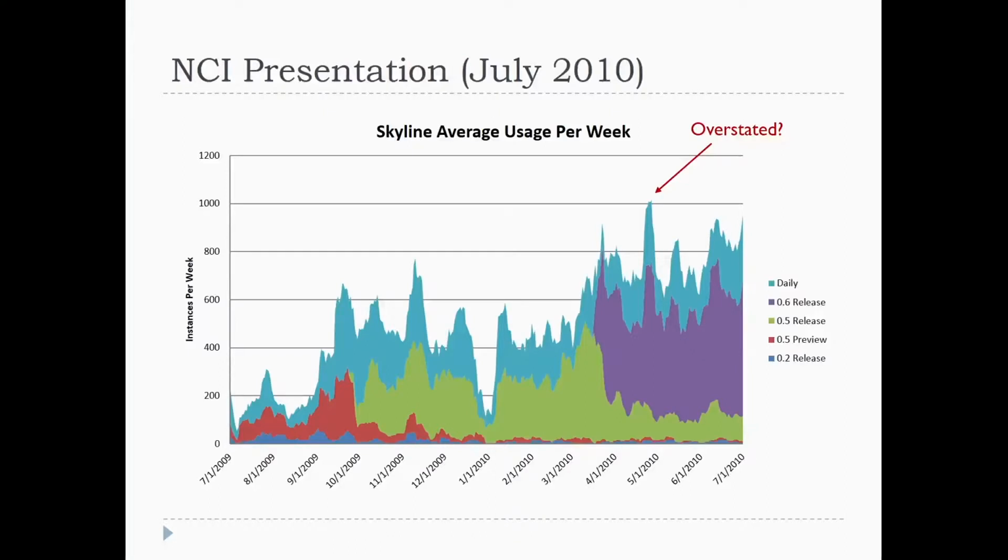This is something that I presented to NCI in 2010, after almost 2 years of developing Skyline, and I was super proud. I said, man, look, it was started 1,000 times in a week. This is showing the releases that I'd done, and it didn't get back up to 1,000 for a while, and I felt really guilty. I was like, oh, did I overstate that? But here you can see the releases. Can anybody guess a question that was asked to me from the NCI? I've been at it 2 years.